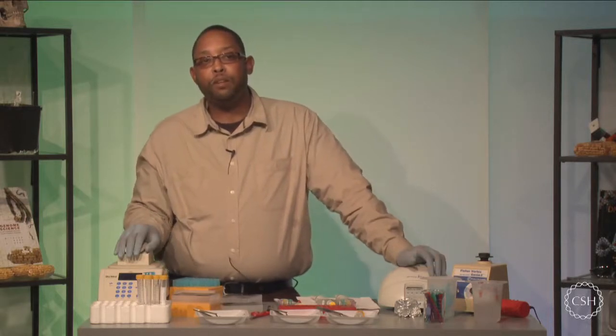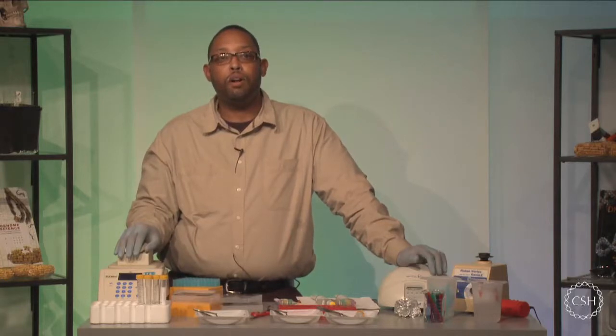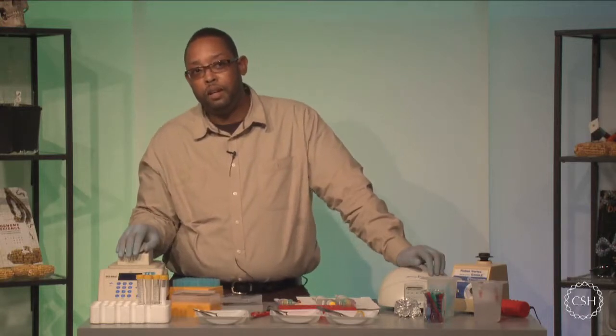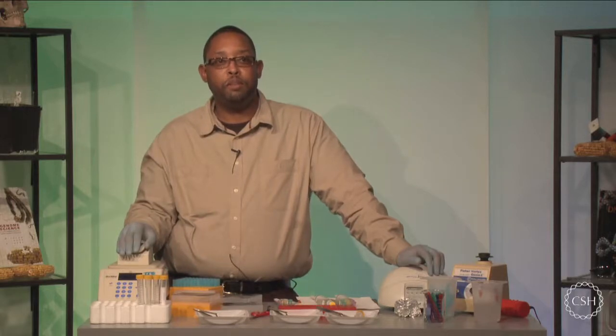So I think there's going to be a download for the protocol so that you can see the physical reagents. The protocol will be up onto the website relatively soon, so please keep an eye out for it. But there is going to be a download for you to physically look at for this isolation from this webinar.